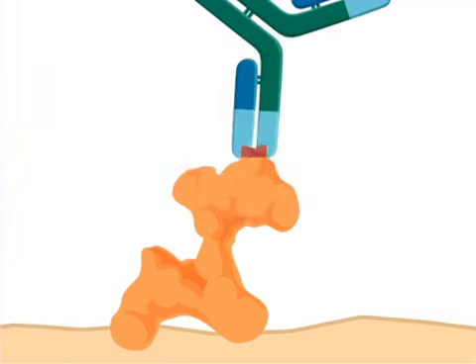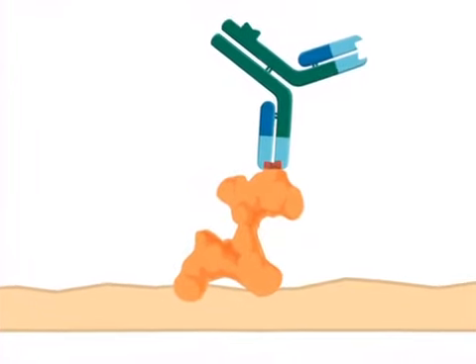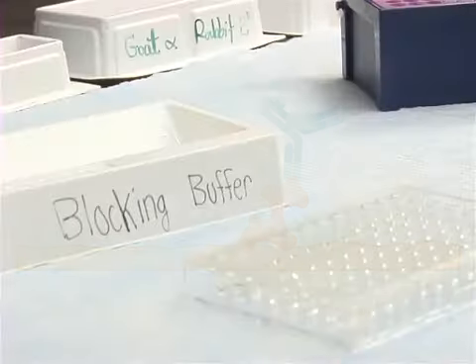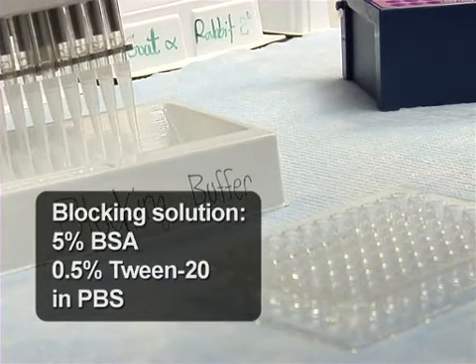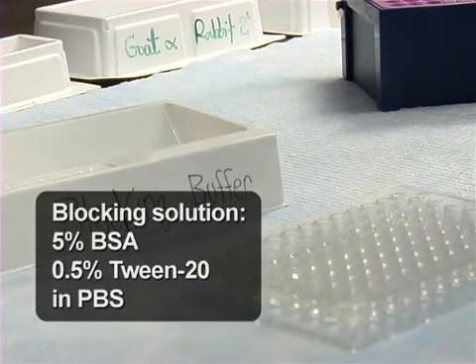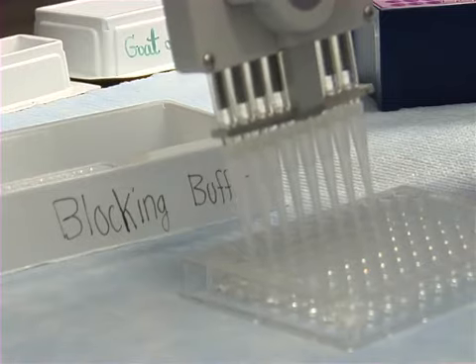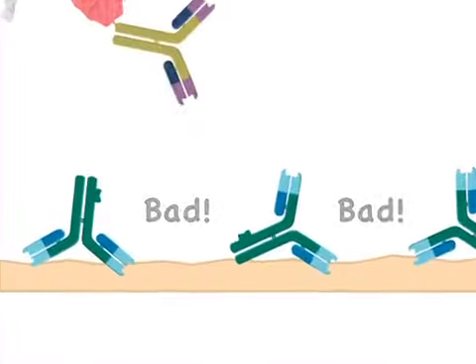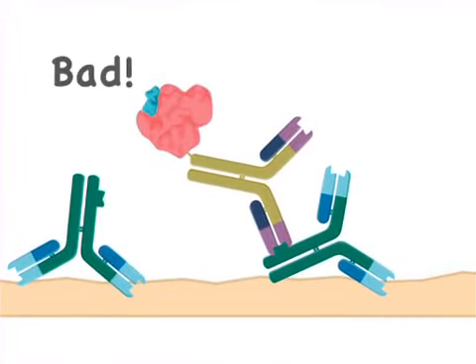As mentioned, antibodies mostly bind to their target proteins through high-affinity binding to a specific epitope. However, the experimental sample may contain pieces of cells that express non-specific binding sites, sites that can bind the constant or non-epitope-specific region of your detector antibodies. Therefore, addition of a blocking buffer is essential in an ELISA to cover any non-specific binding sites in your experimental samples. Otherwise, you may have enzymatic reactions occurring in wells that do not contain target protein, giving you false positive data.